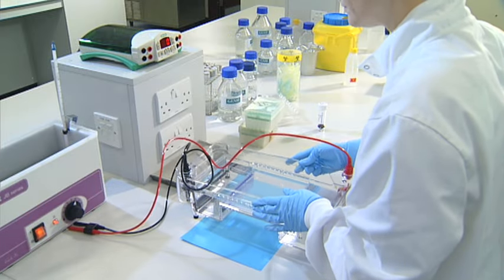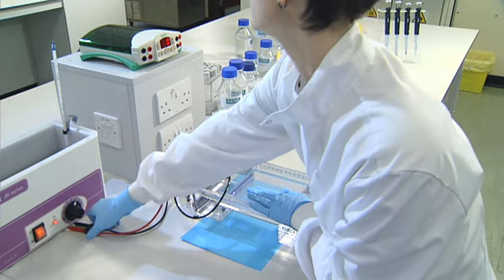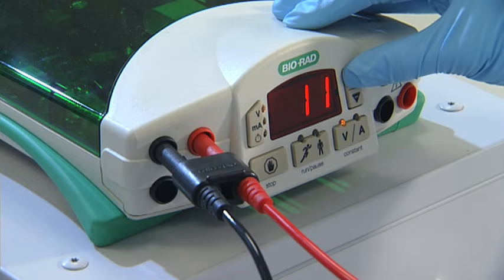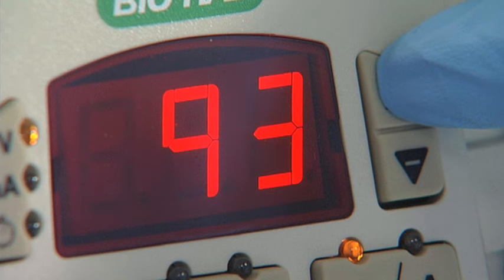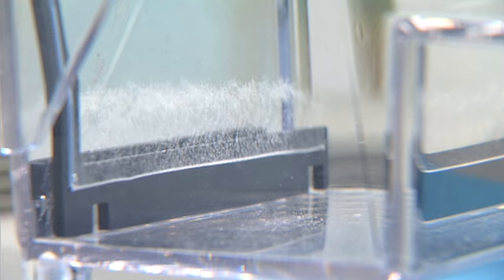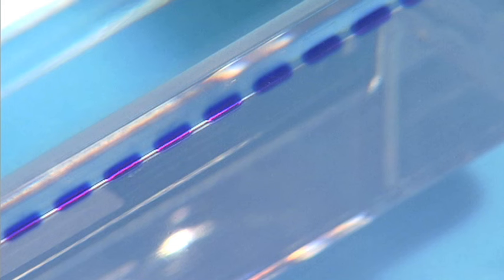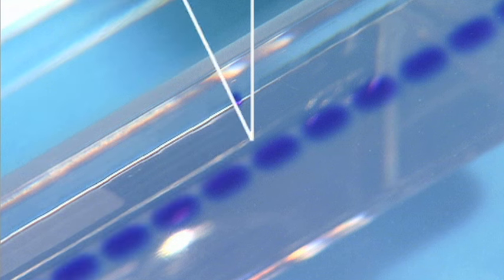Close the lid of the gel tank and attach the leads both at the tank and the power pack the correct way round. Set the appropriate constant voltage. This will create an electrical current through the buffer and the gel, starting the process of size separation of the nucleic acid fragments. You should be able to see bubbles rising from the negative electrode. After a few minutes, the dye — and therefore the nucleic acid fragments — can be seen to migrate from the wells into the gel, showing that the process is working.